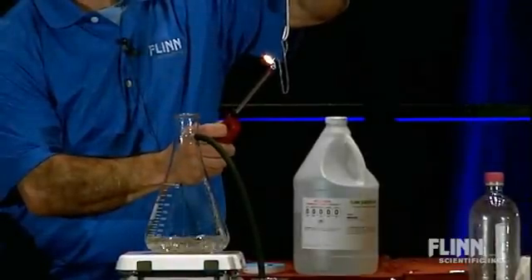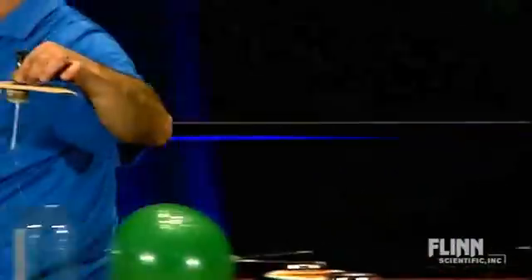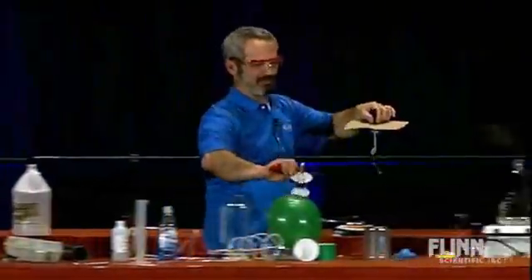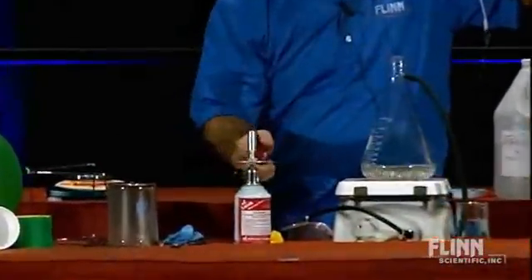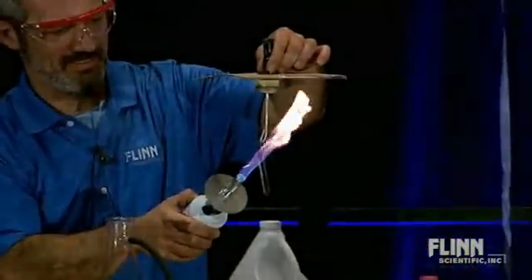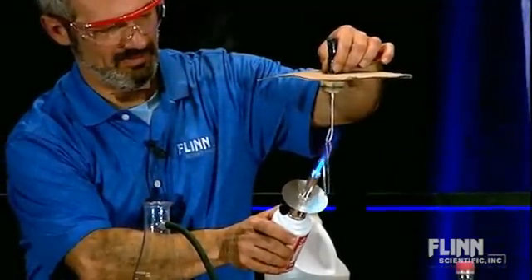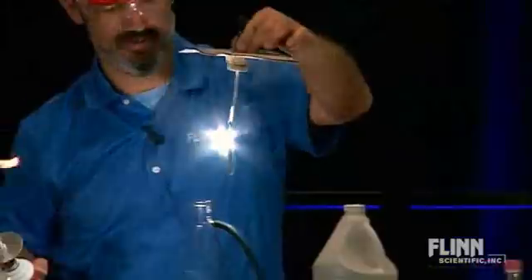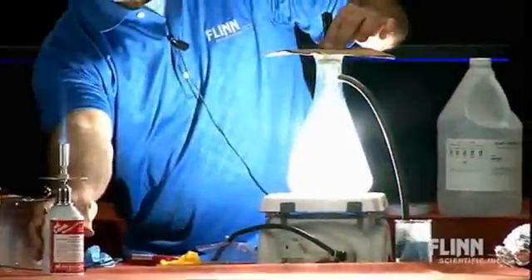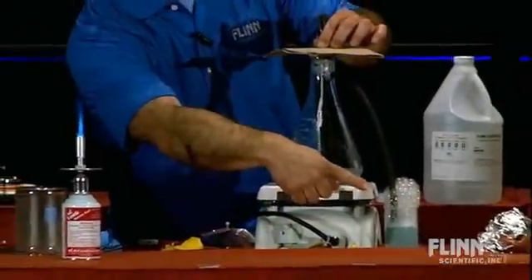I'll switch to my little Bunsen burner if I can't light it here. There are air currents up here, but that's okay — we're ready for anything. There we go! Look at how brightly it's burning in there. And look what I've got over here — bubbles.